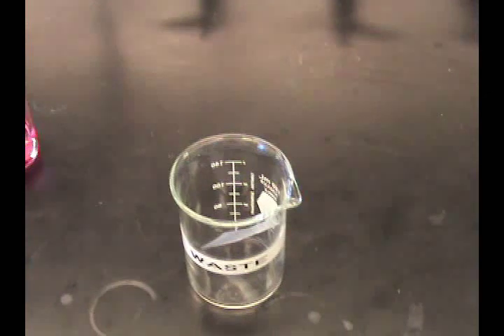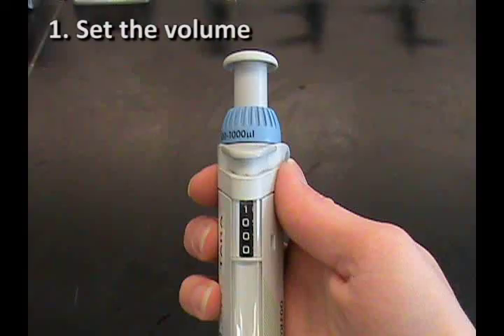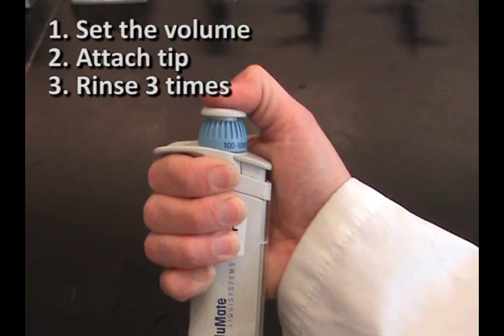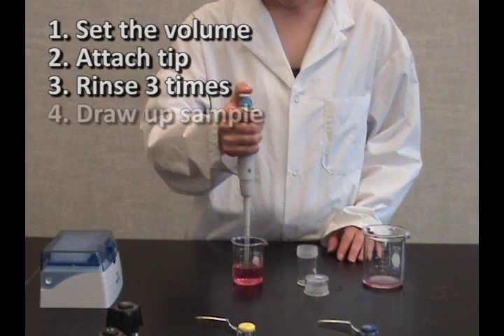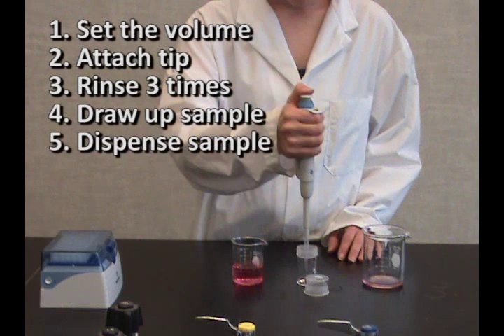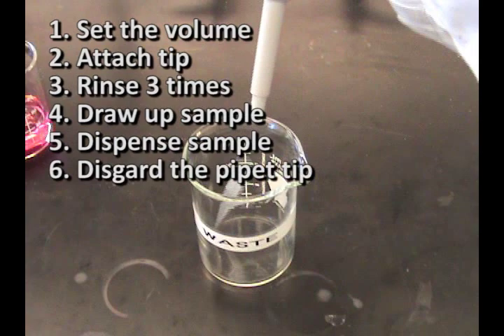Let's review the steps: Set the volume. Attach disposable tip. Rinse three times. Draw up the sample. Dispense the sample. Discard the tip.